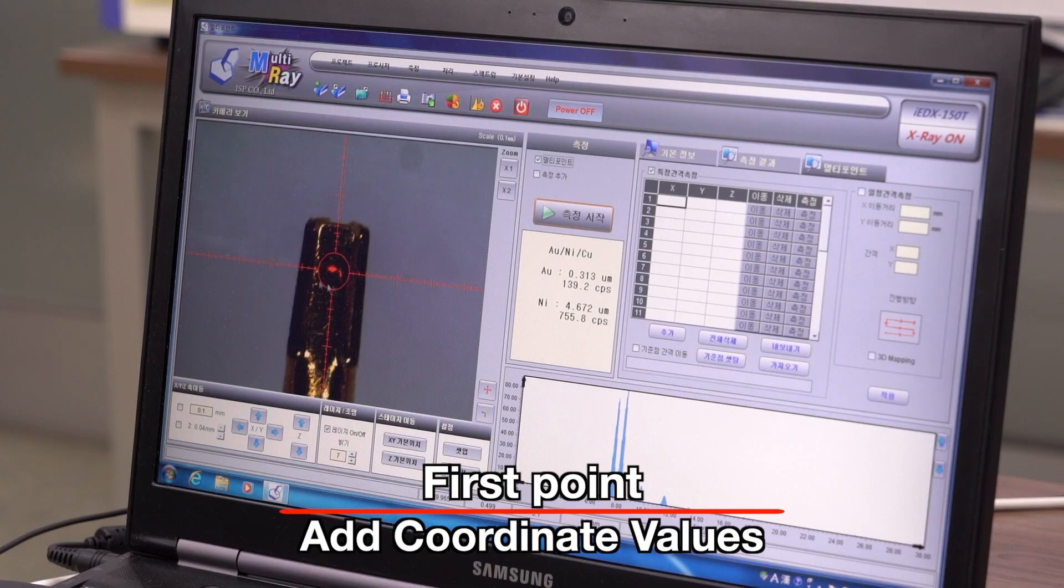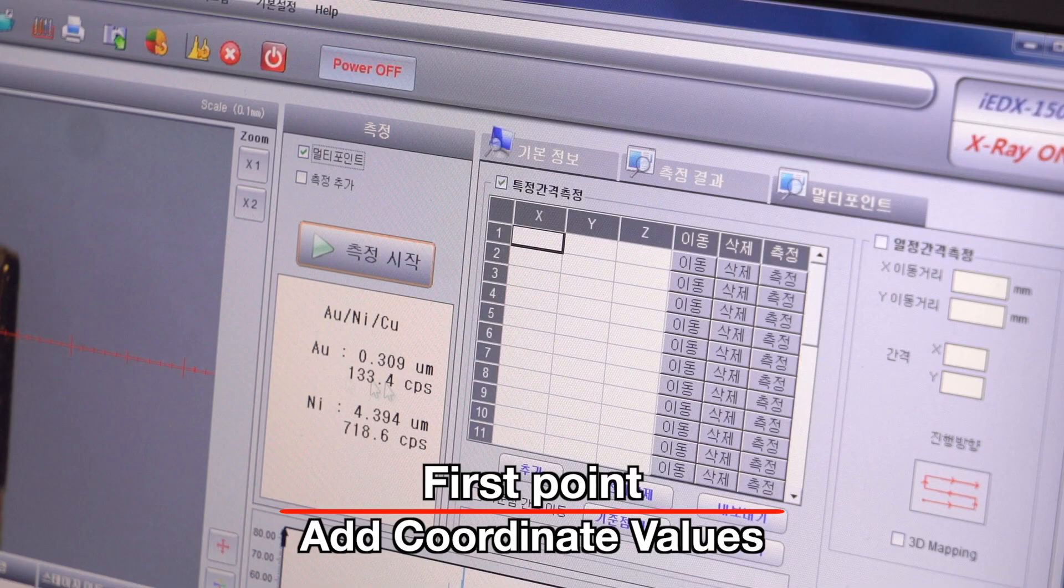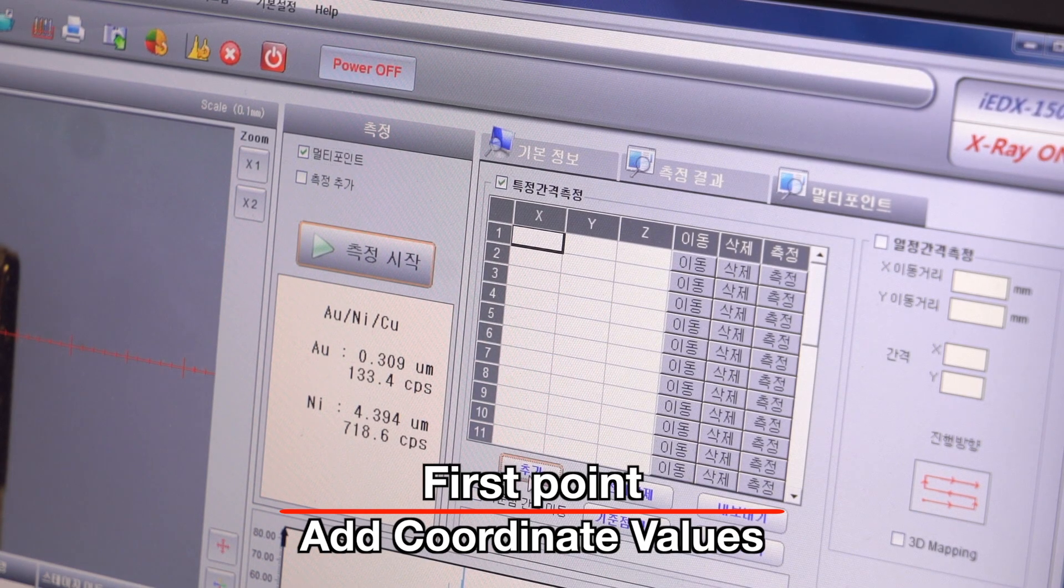After aligning the laser pointer position, press the add button.